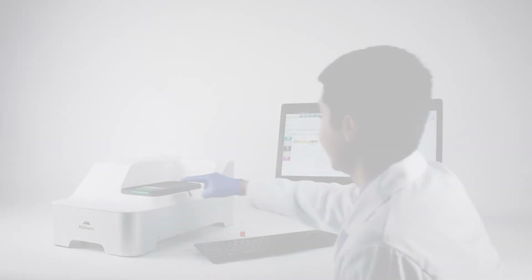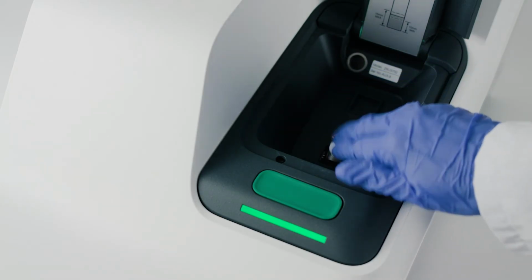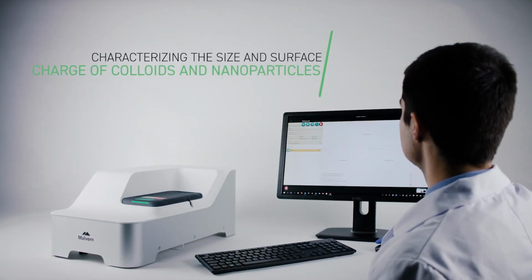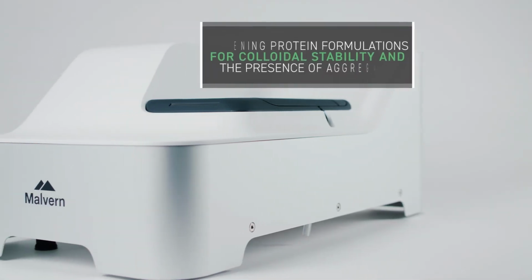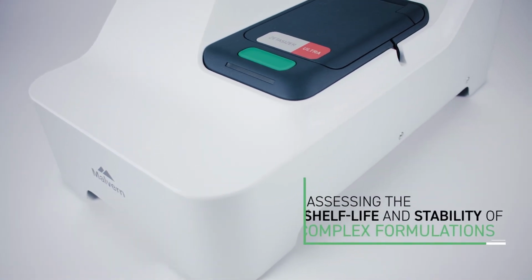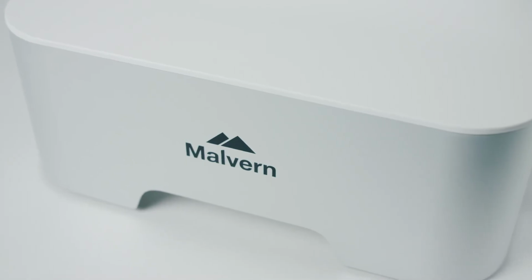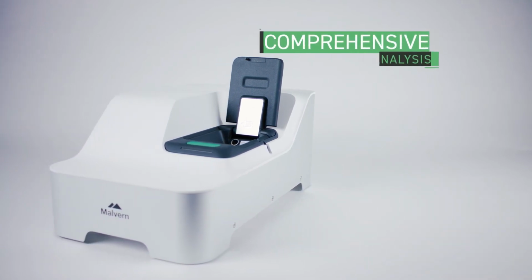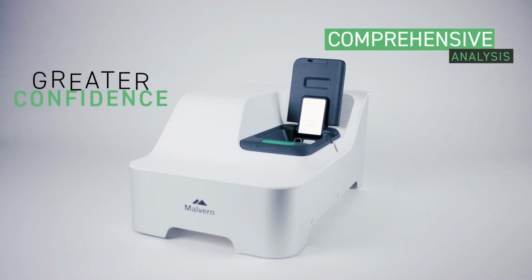The Zetasizer Pro and Ultra find use in a wide range of industries and applications. Examples include characterizing the size and surface charge of colloids and nanoparticles, screening protein formulations for colloidal stability and the presence of aggregates, assessing the shelf life and stability of complex formulations. By combining novel measurement capabilities with advanced data analysis, the system provides a comprehensive analysis of your materials, giving you greater confidence to make your next move.